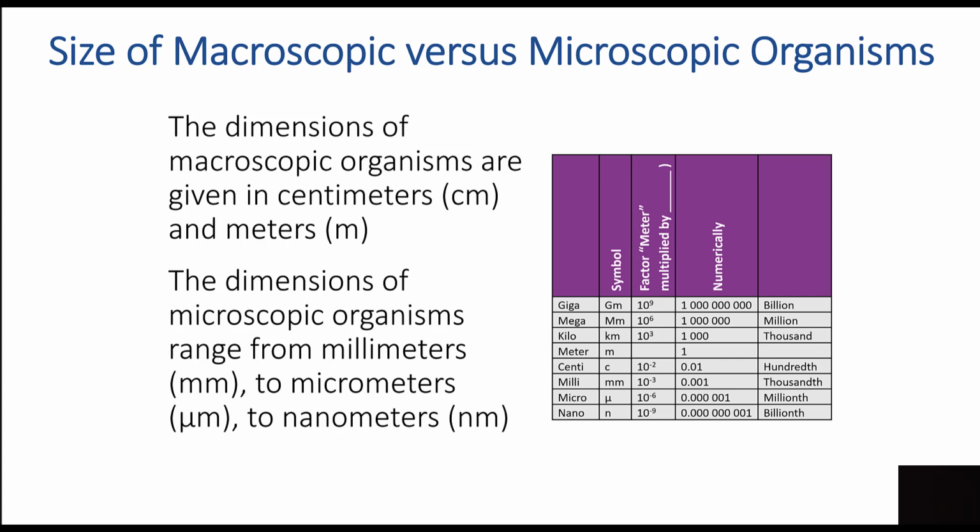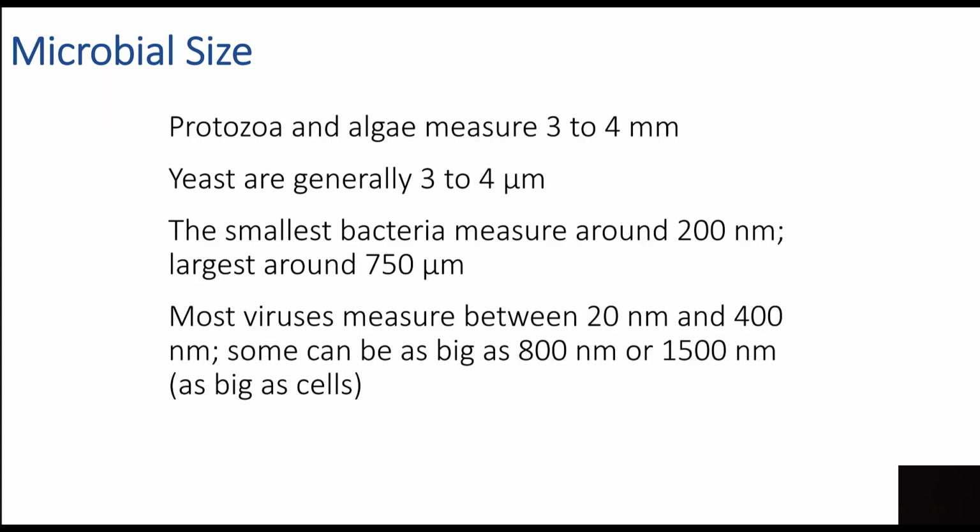When we use the microscope, of course, we have to be concerned with what we are able to do in terms of how small we can go. And we are living in the nano age, down to the billionth. So that's 10 to the minus 9th, nano, Latin for 9. So the dimensions that we can do now, believe it or not, are really close to the atomic scale. And that's what we're after. So that's important to us.